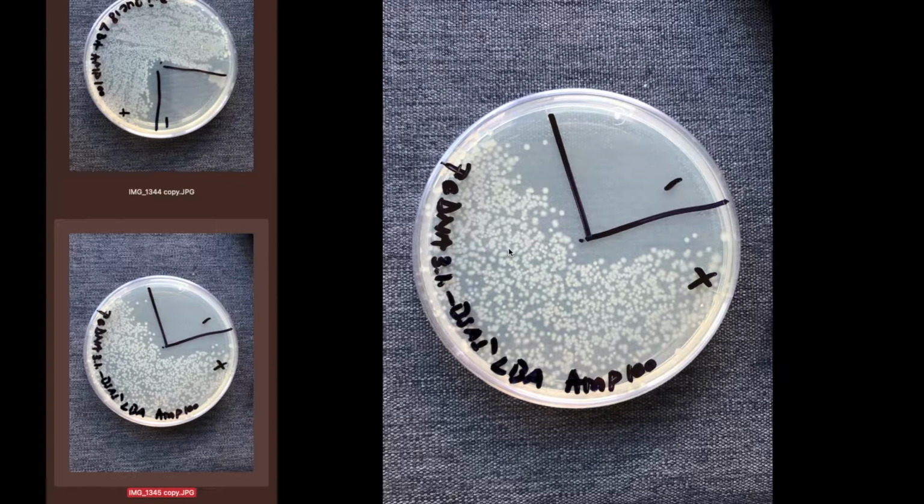So this tells me a lot. This tells me that the plasmid is present. However, how do I know if my plasmid is really there, or to be more specific, if the plasmid I wanted to insert is there? Because I don't know, it could be any other plasmid. Maybe I mixed up the tubes and stuff like that.